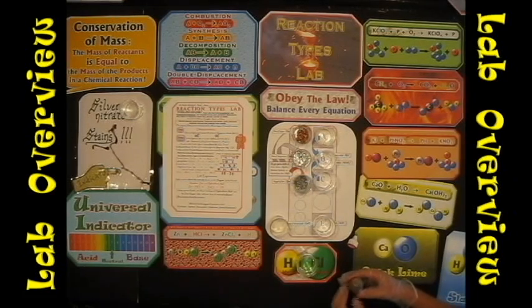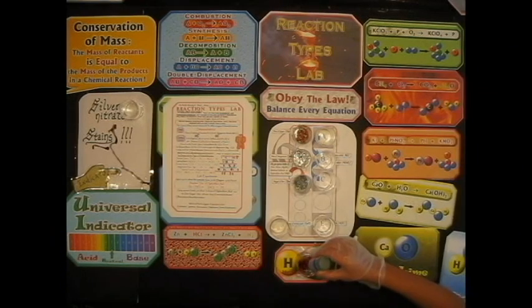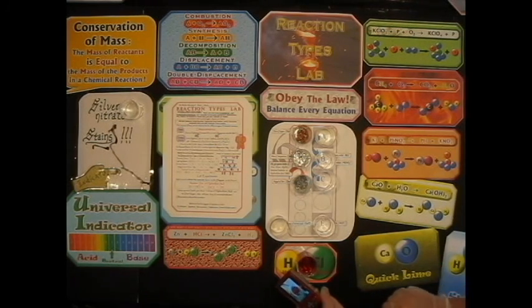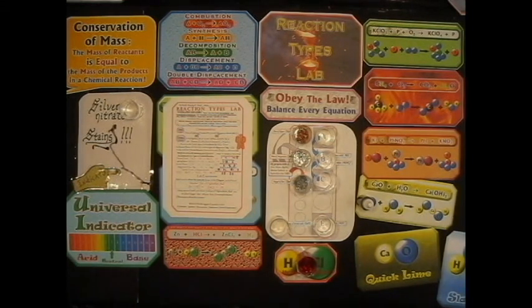Let's see. Put in some squirts. We're doing it on a big scale, so we're putting in more than the instructions call for. Okay, there we go. That's red. So that's pretty reddish. Right now, liquid colors are different than colors on paper. But I'd say that definitely falls in this range over here, right? Wouldn't you say? Yeah. Okay, so we are going to be reacting that with the zinc.